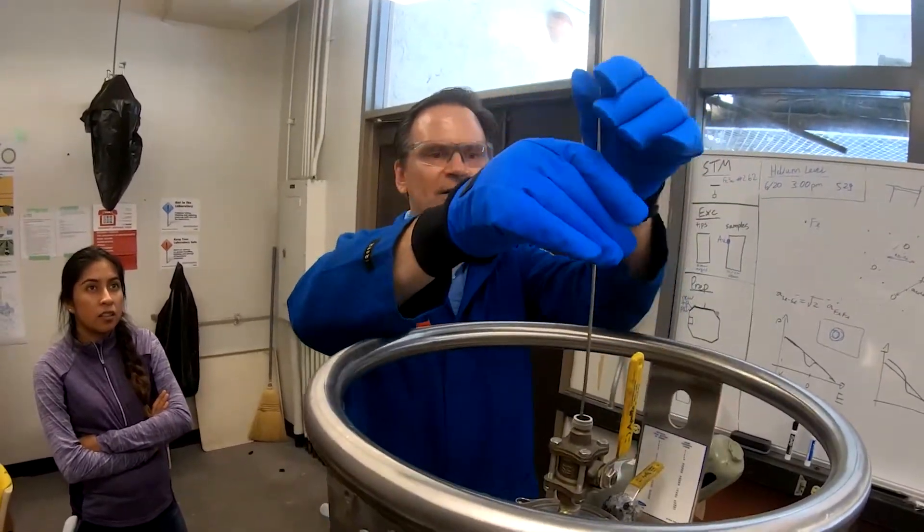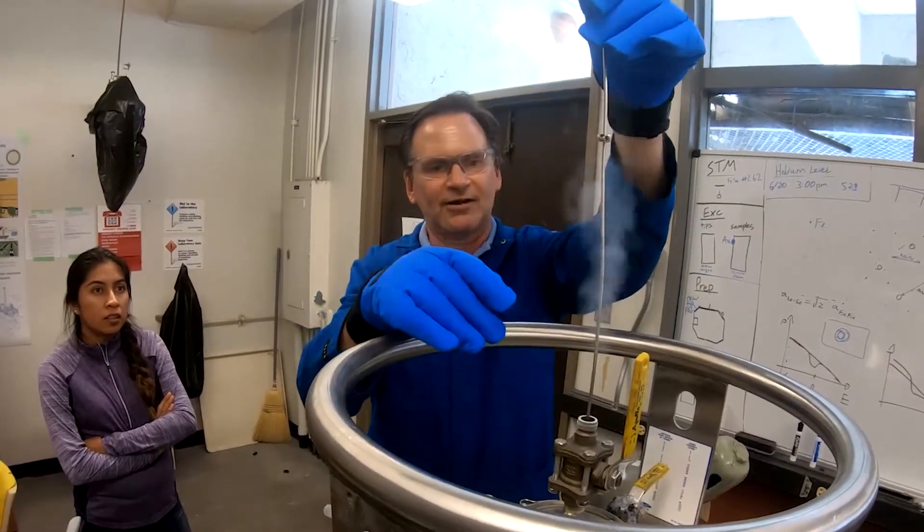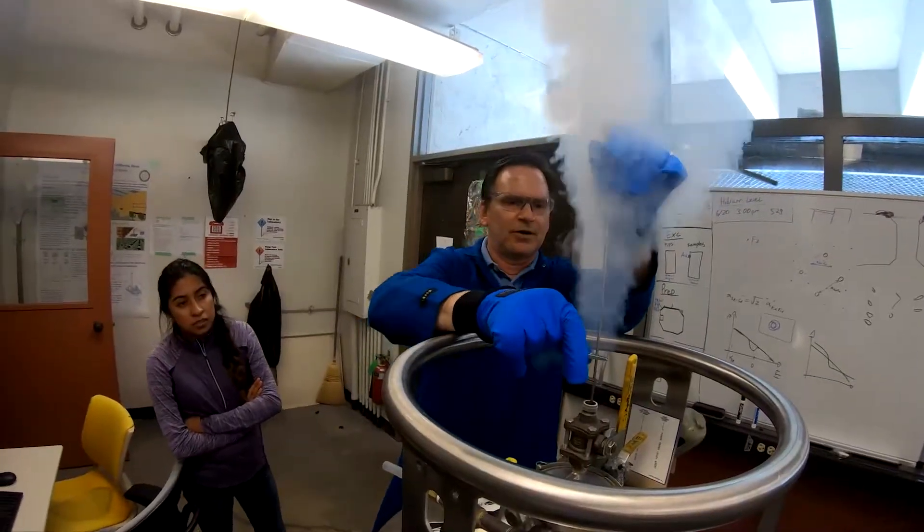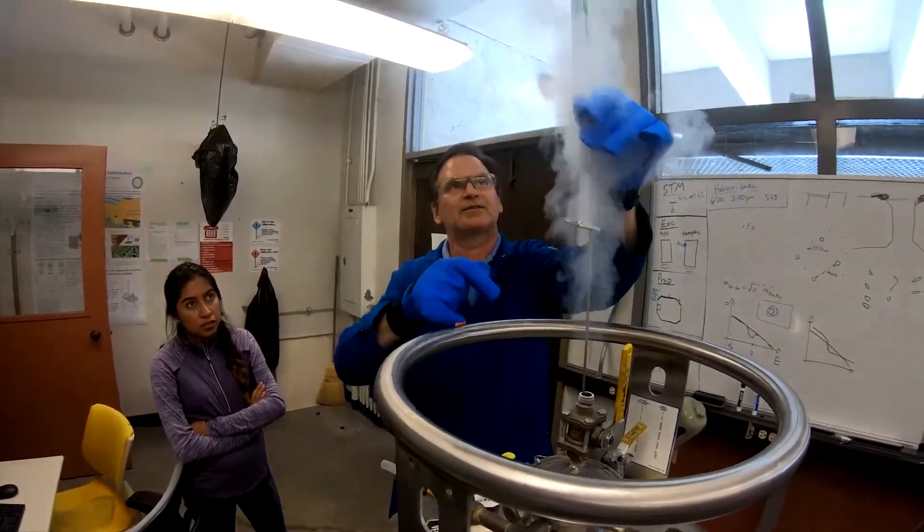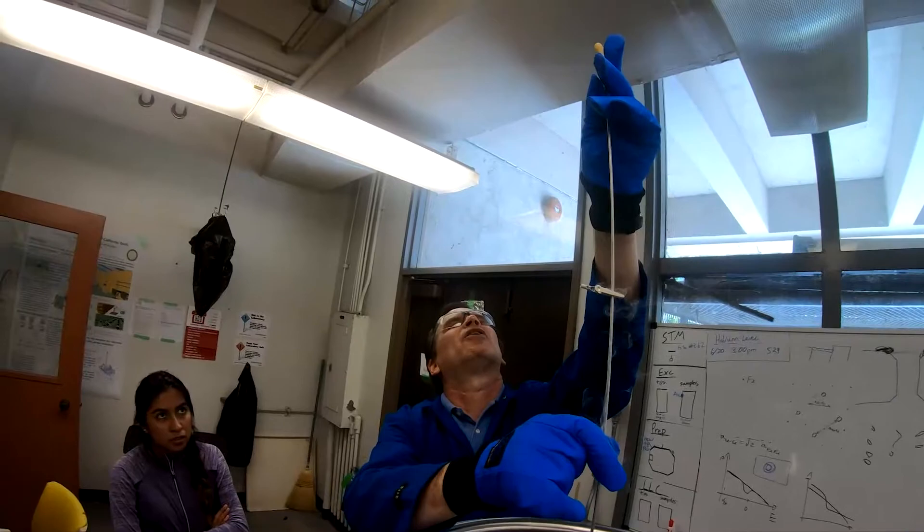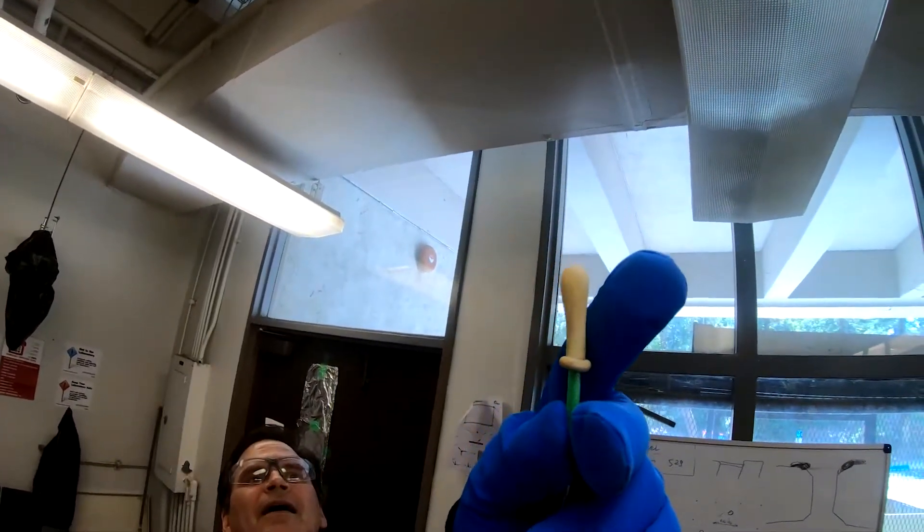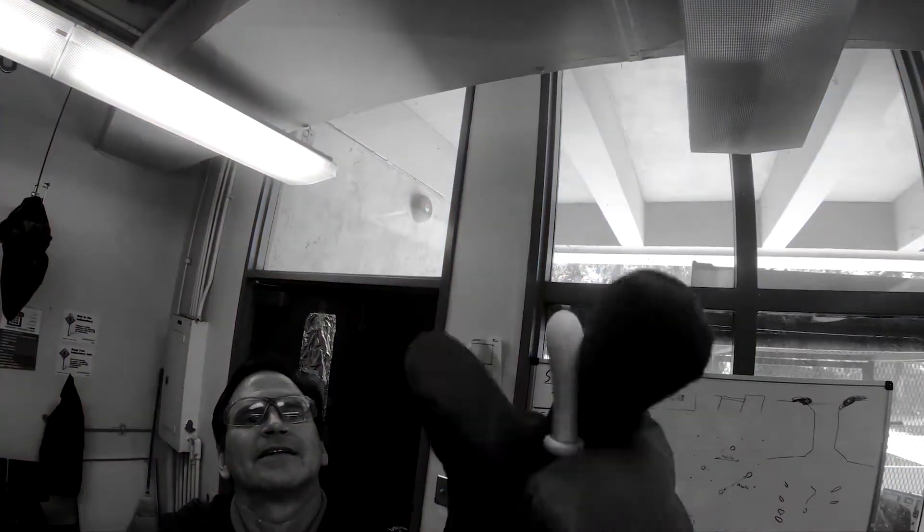So we're going to basically slowly lower this in. We're going to now start to boil up some gas. There's the bottom of the dewar. I'm going to mark the position of the bottom of the dewar. Now I'm going to start to pull it up. Check that bulb. It's going to change, just change frequency.